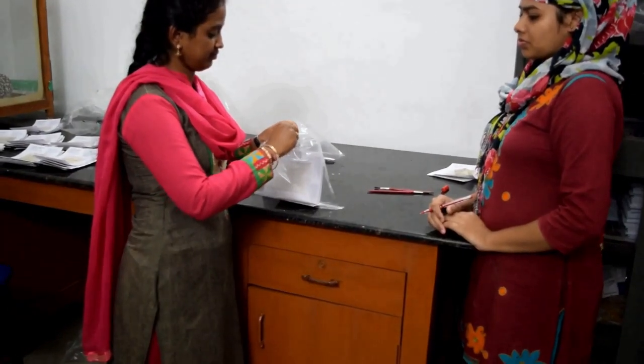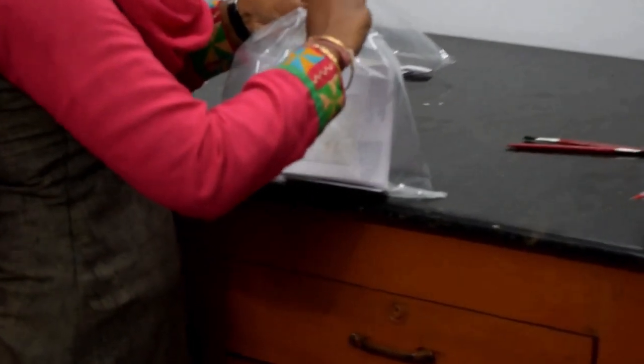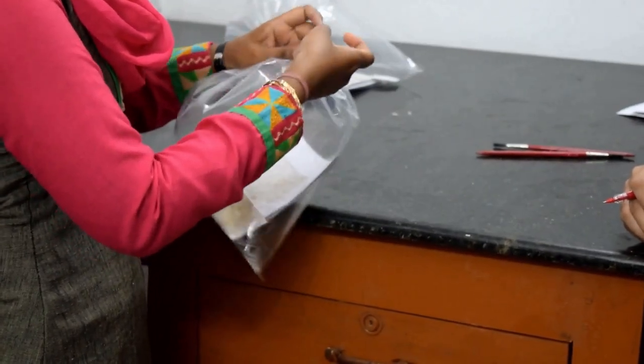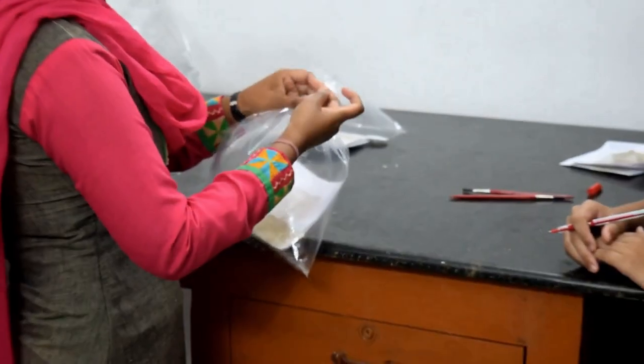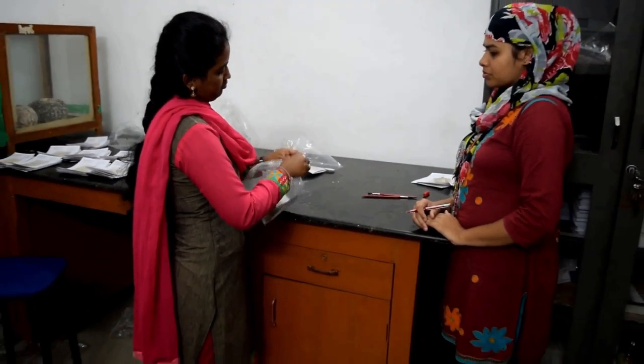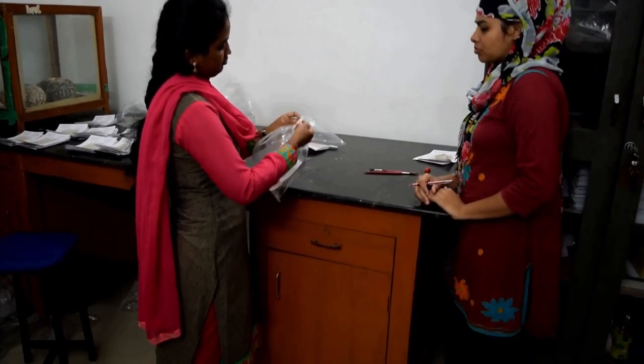Trichogramma eggs hatch in 1 day and the larvae feed on rice moth eggs for 4 to 5 days and then pupate. On pupation, Trichogramma larvae and rice moth eggs turn black and the cards are ready. The bags are opened, the cards are taken out.